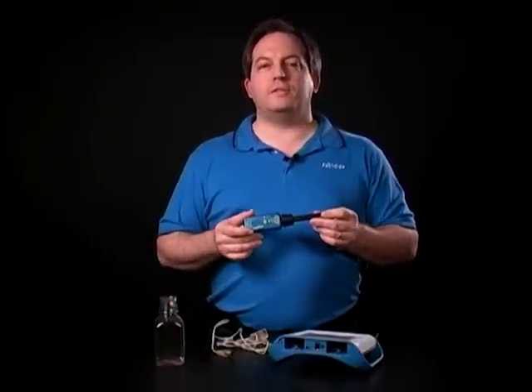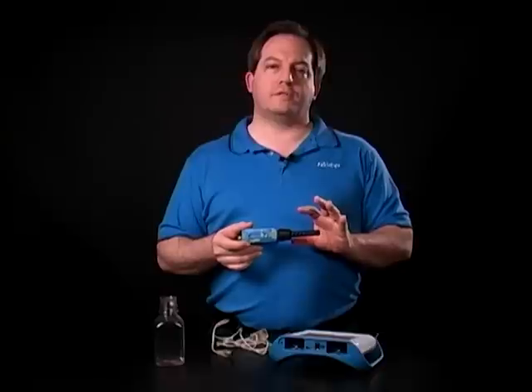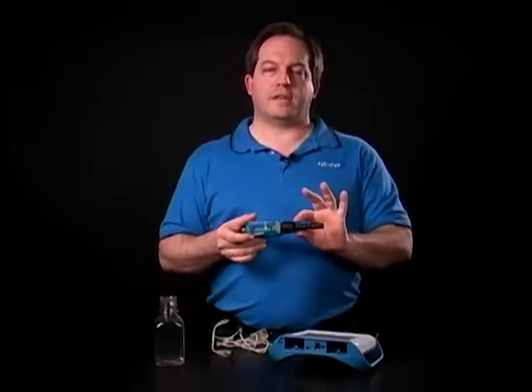Hello and welcome to this quick look at the CO2 gas sensor. The CO2 gas sensor measures the concentration of CO2 in the air as it passes through the snout.